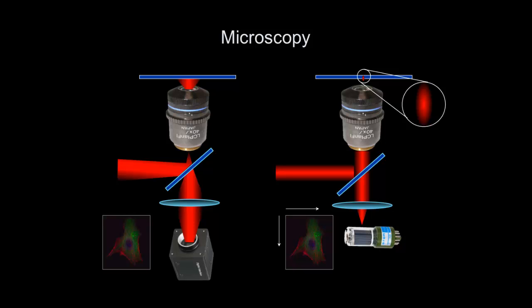Laser-based imaging is called laser scanned imaging. And you build up an image. So that will take a little while. However, you probably know that you can do that very fast. You can have very fast scanners. You can take an image like this in less than a second, which is about the same time it takes to take an image like here. So these two things are kind of complementary. Okay? Different approaches will give you approximately the same result. However, this method has some advantages, as you will see in 2 seconds, in particular for tissue imaging.